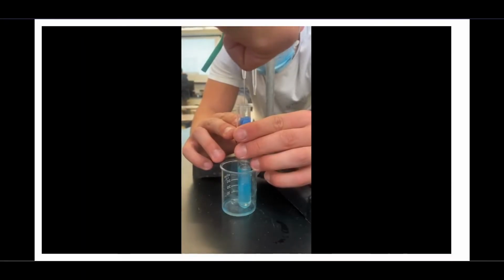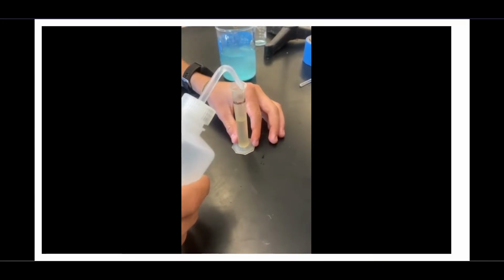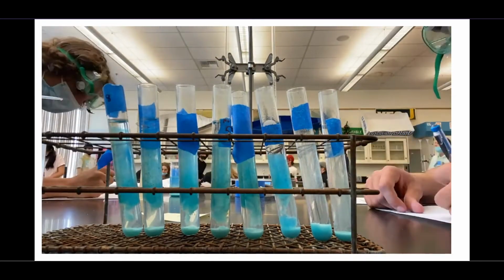We started by filling each tube with 5 milliliters of copper sulfate. Then we filled each tube from 1 to 8 with an increasing amount of KOH starting with 1 milliliter to 8 milliliters. Finally, we finished off each tube with the correct amount of distilled water to raise each test tube to a total of 13 milliliters.